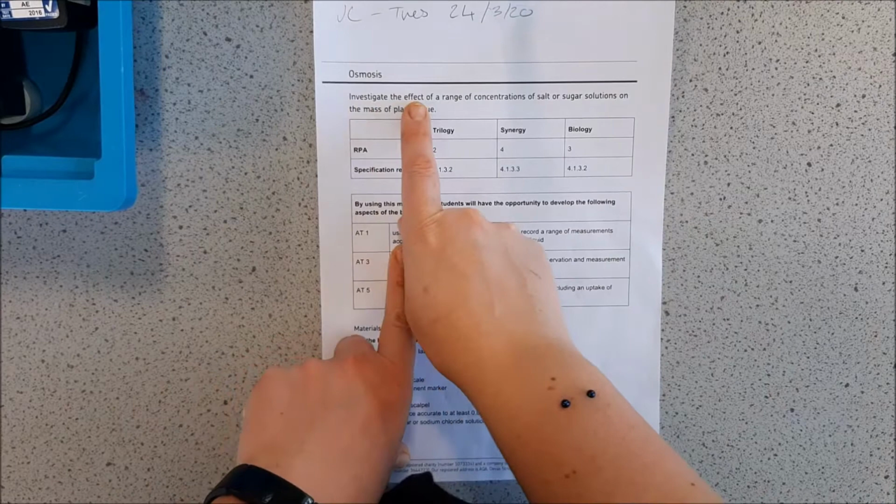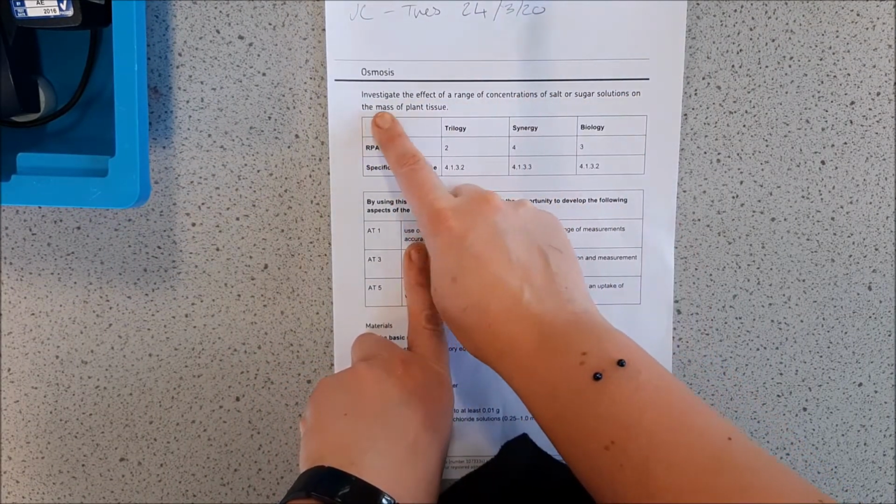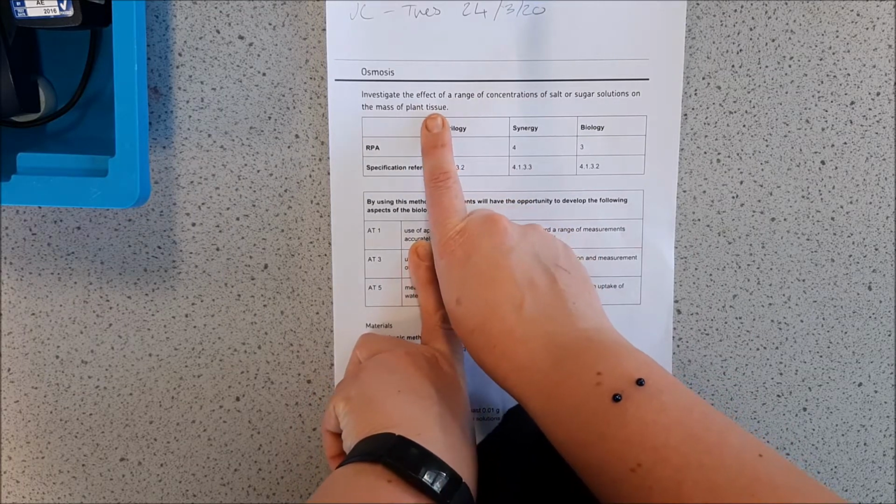So we're going to go through those. You will get examined on this. You'll be asked about the measurements you take, working out percentage loss, percentage gain, and your general use of biological equipment and know-how. Now, this is the required practical. So we are investigating the effect of a range of concentration of salt or sugar solution on the mass of plant tissue. So it can be any plant tissue.